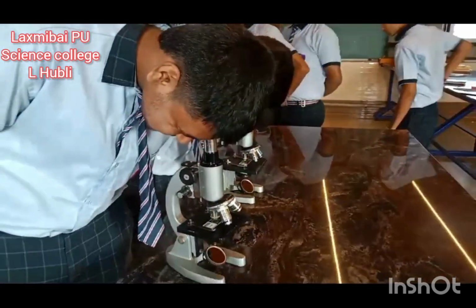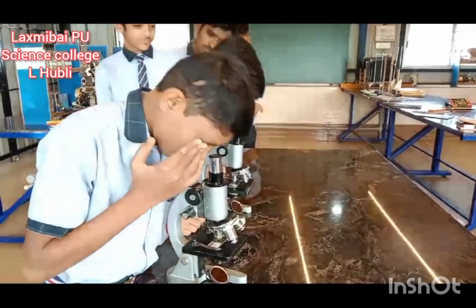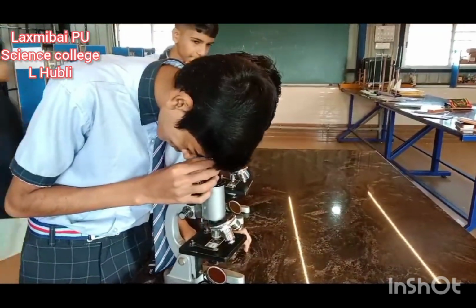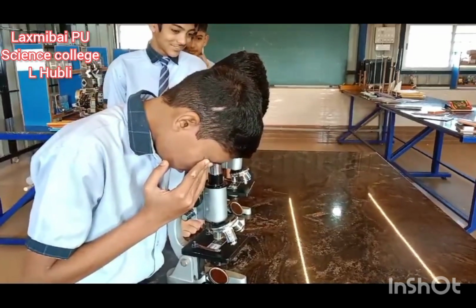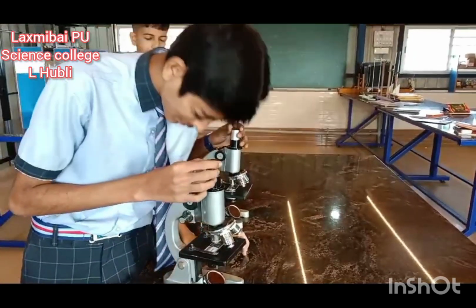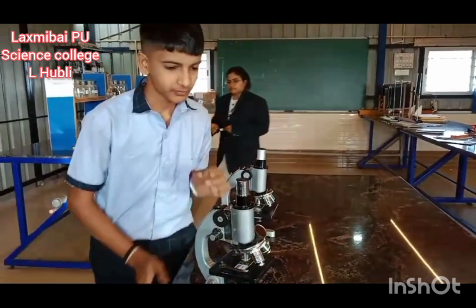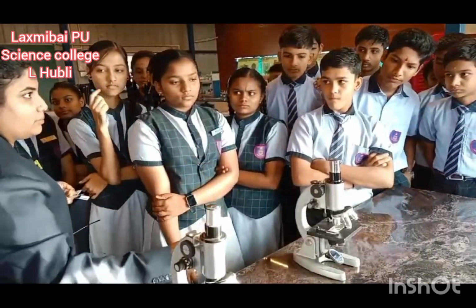Okay. Observe with your left eye. Observe with your left eye. Clearly observe, but don't touch the table. The table is shaking. One by one you can observe.